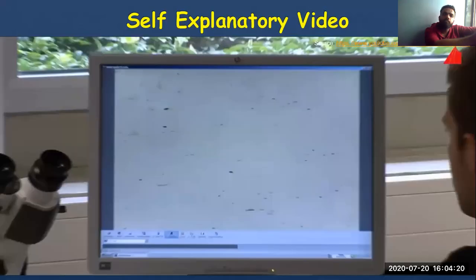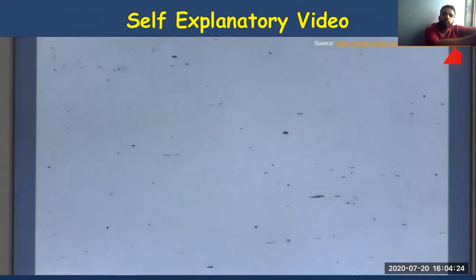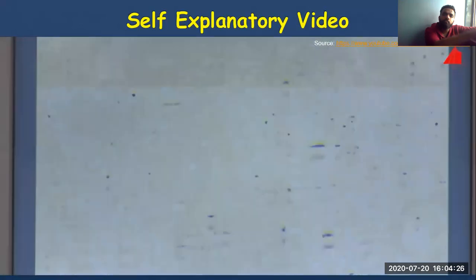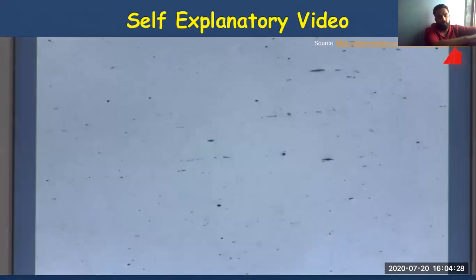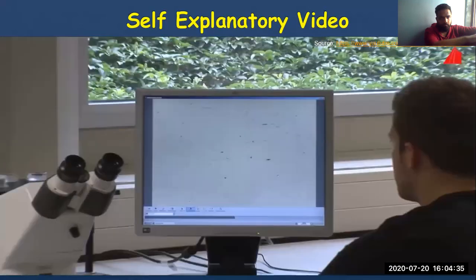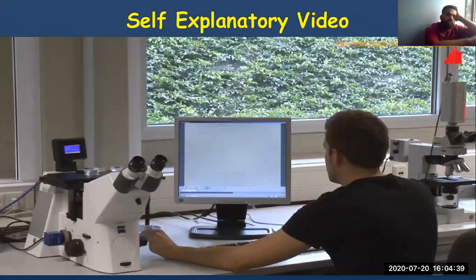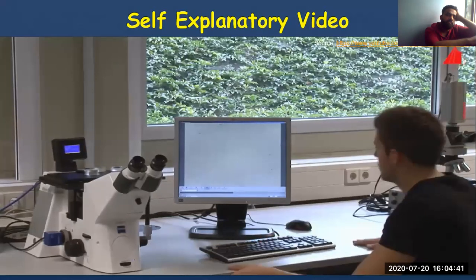In the polished state, there isn't much to be seen in this material. Only some elongated non-metallic inclusions can be observed. But if these inclusions are of special interest, then the polished state is the perfect one. Inclusions may best be seen here. However, if one wants to see the crystals, the grains and grain boundaries, then the microsection has to be etched.